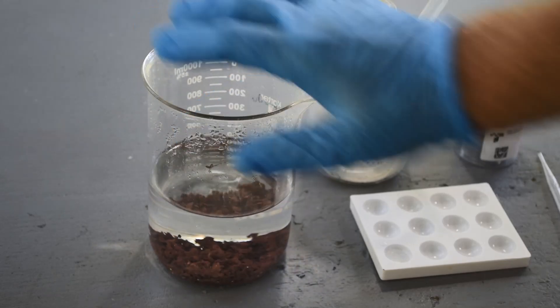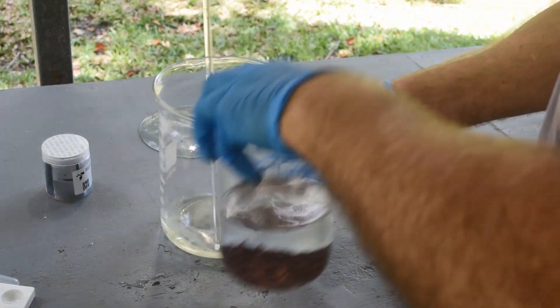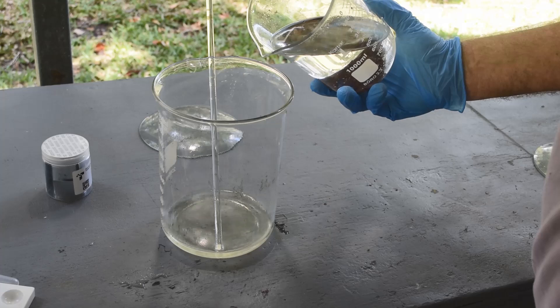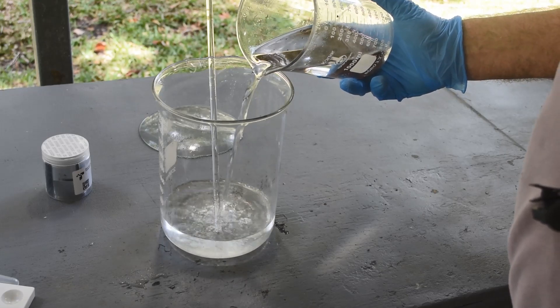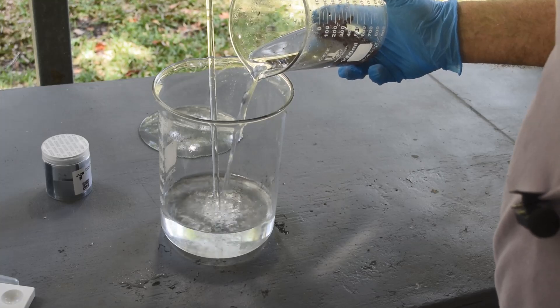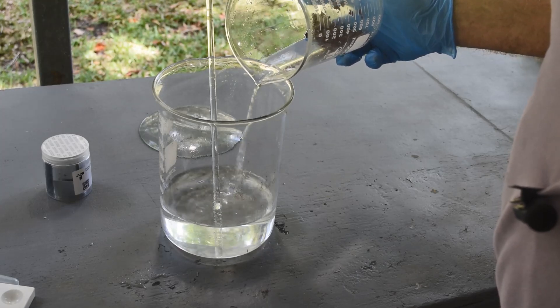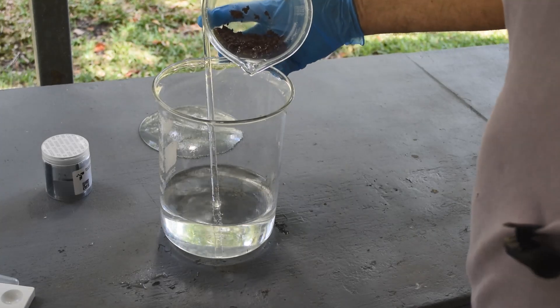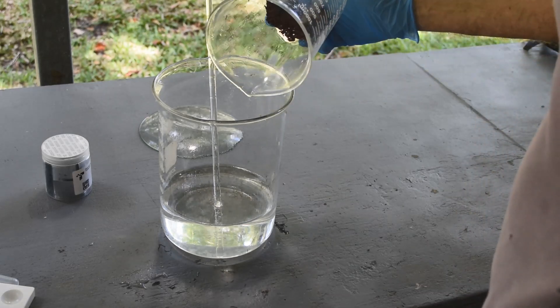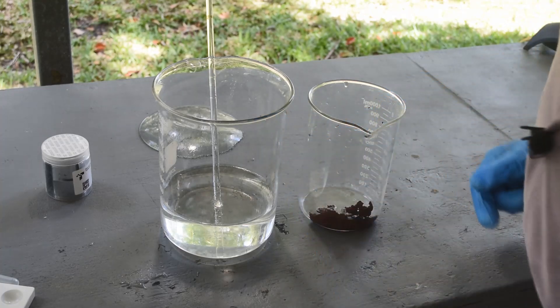I'm going to pour off this liquid and start giving this metal some distilled water rinses to get the zinc and any residual acid out of it. I'll pour the liquid off into this beaker. Rather than just rinsing it, I'm going to put it in the fume hood and give it some distilled water boils to really clean it up. Lost a couple little crumbs of metal but not too much. That has a distinct look of copper to it — I'll bet most of that metal is copper.